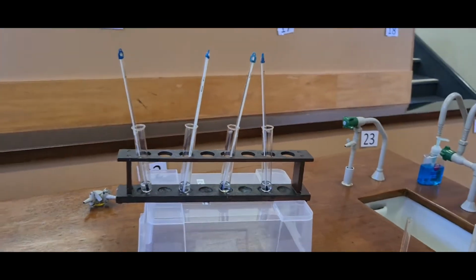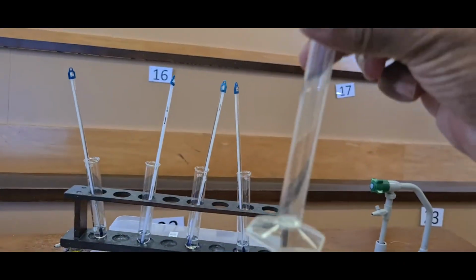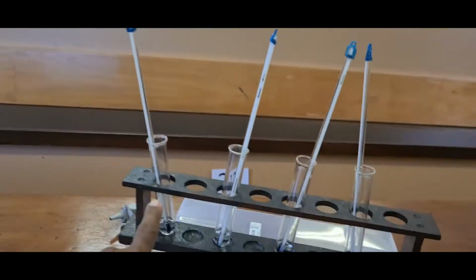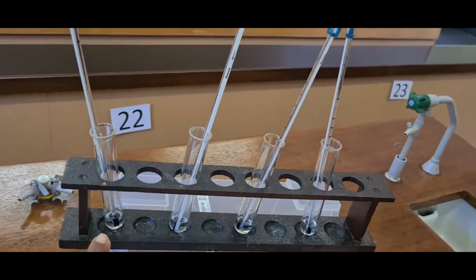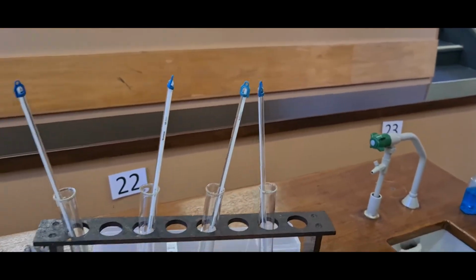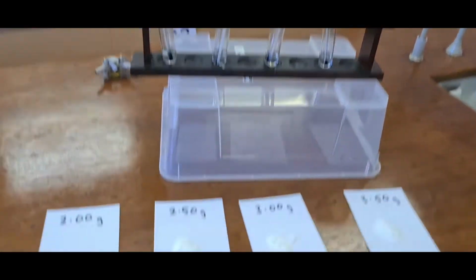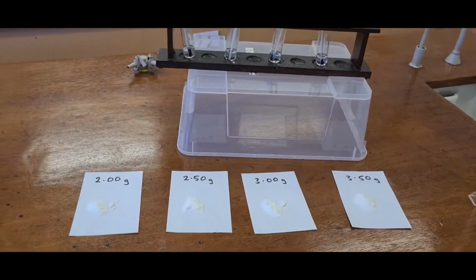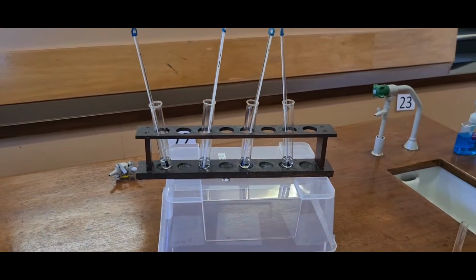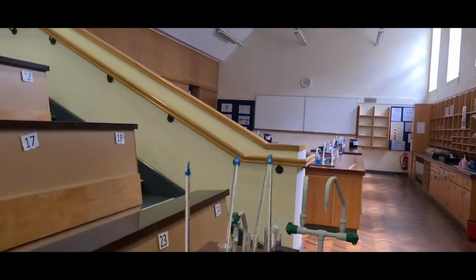Using a small 10 millilitre measuring cylinder, I've put 5 of distilled water in every one of these 4 test tubes. So I'm going to put these masses into those test tubes and repeat the experiment 4 times all together.